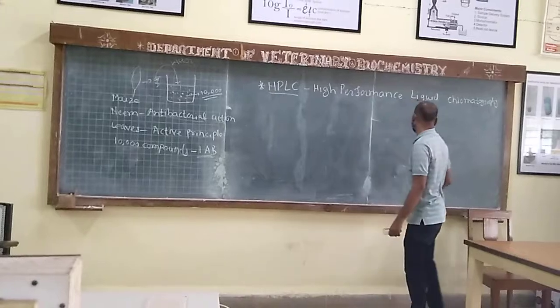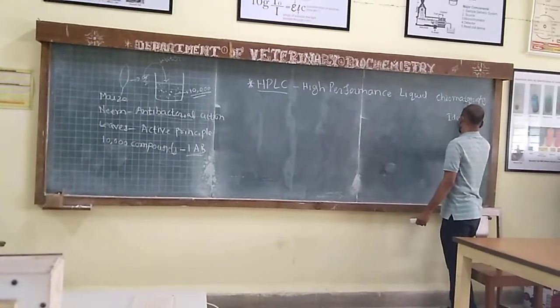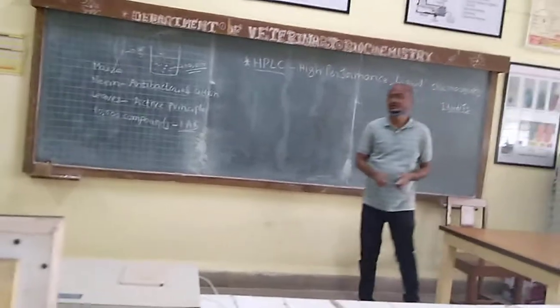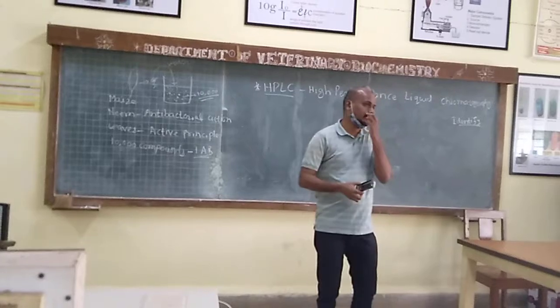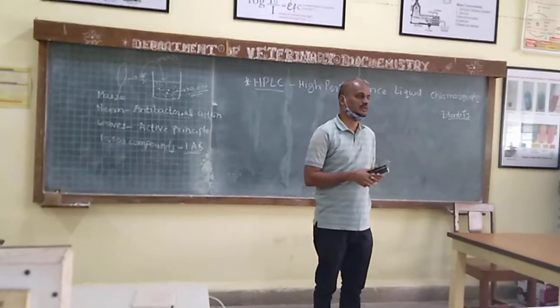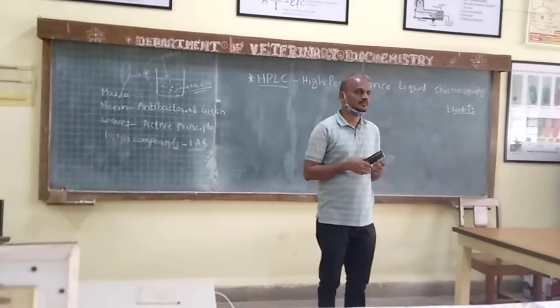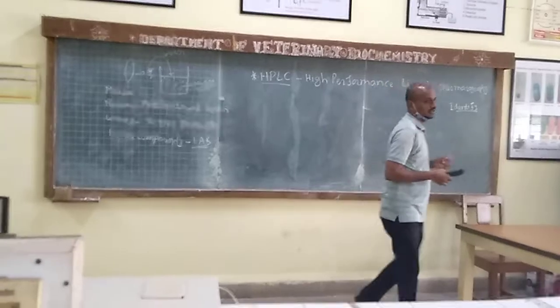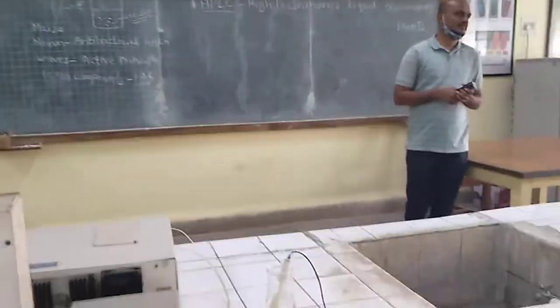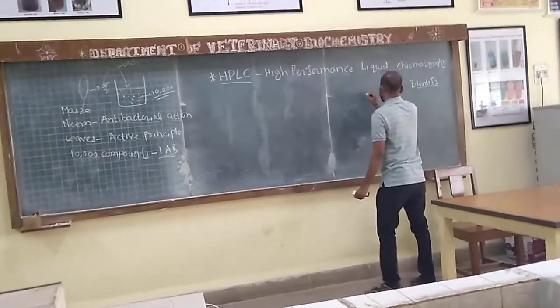So what is our objective here? We want to identify the particular molecule, right? Next, after giving how many leaves do we expect to have antibacterial property? Take a random number, for example, grams or something. 500 grams. For example, we are saying 500 grams.